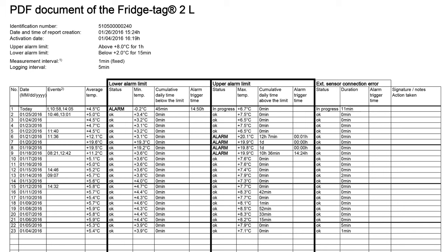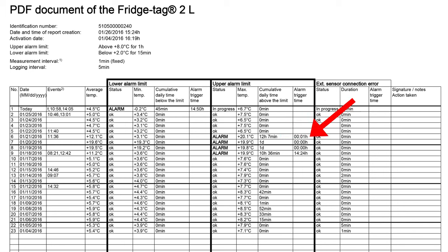It was 20.1 degrees C for 12 hours and 7 minutes, and it happened just one minute after midnight.